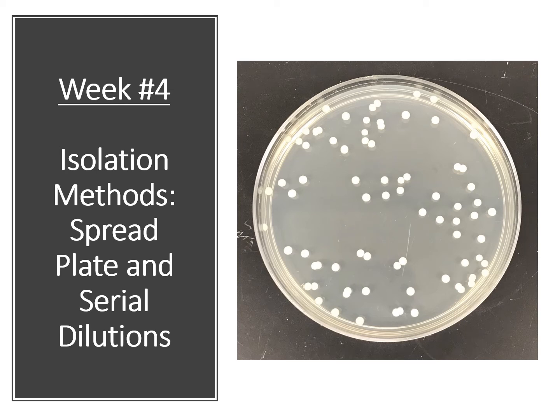Hello everyone. We're going to continue talking about isolation methods, and in this video we're going to concentrate on spread plates, and we're also going to talk about serial dilutions.